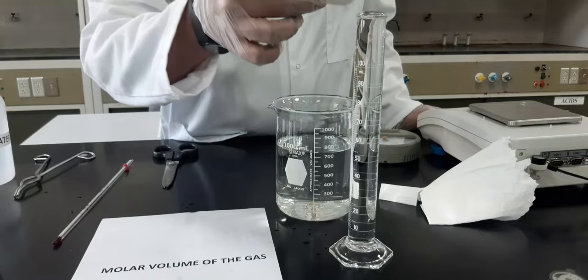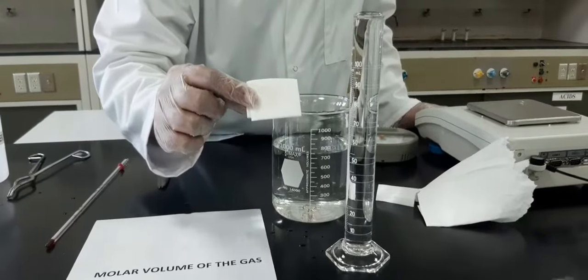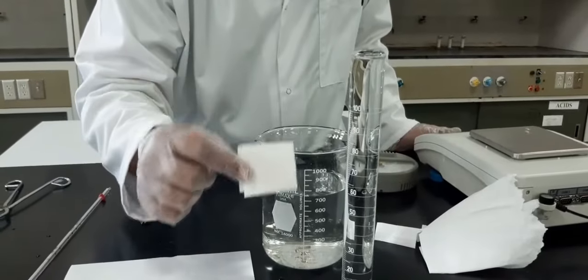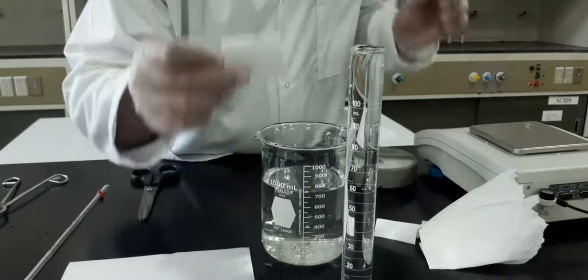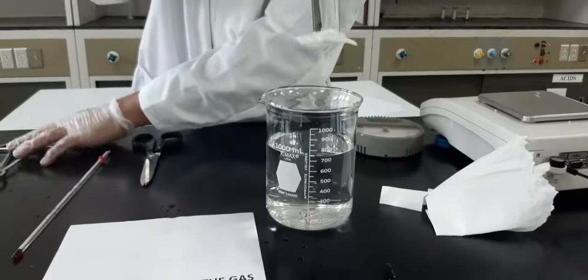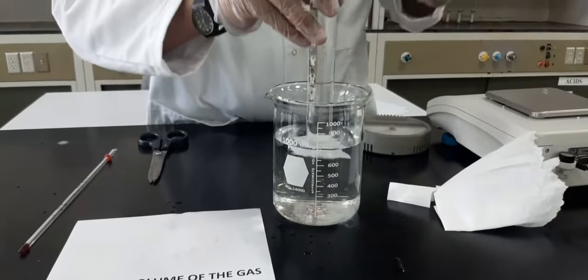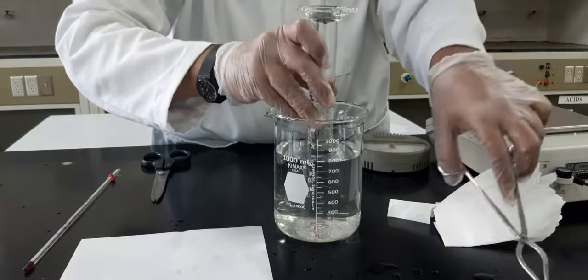I'm going to place it up there, and after placing this tissue, I'm going to quickly put the cylinder inside the beaker and remove the tissue by the crucible tongs. There we go. We place the tissue up there, bring it upside down, take the crucible tongs in hand, bring it inside the water, remove the tissue paper and place it over the piece of magnesium.